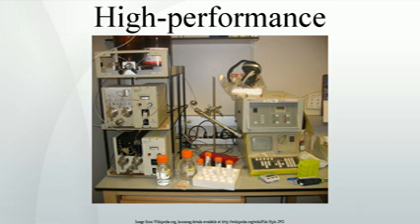Displacement chromatography. The basic principle of displacement chromatography is that a molecule with a high affinity for the chromatography matrix, the displacer, will compete effectively for binding sites, and thus displace all molecules with lesser affinities. There are distinct differences between displacement and elution chromatography.